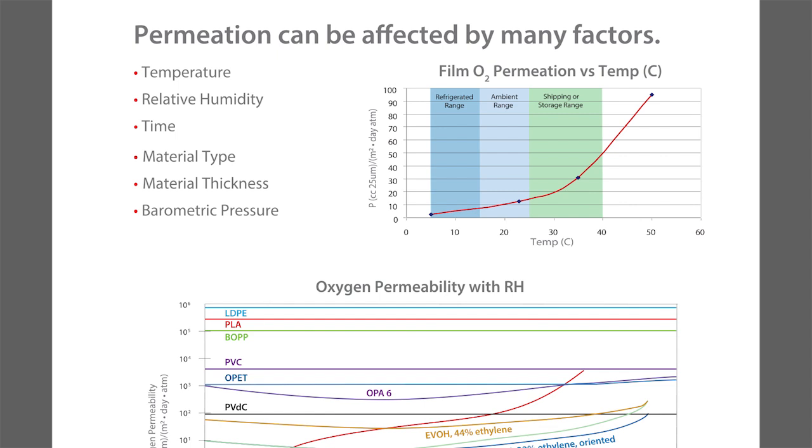So normalizing the thickness can be key, but many times people want to know what's going through my tray, what's going through my pouch. So what is going through this tray of this thickness for OTR? It's something to consider. If you need more barrier, you can make a sample thicker. That's a common thing to be done. Think of the bottle I talked about with the carbonated beverage, a soda pop bottle. It has a nominal thickness. Water bottles can be very, very thin.